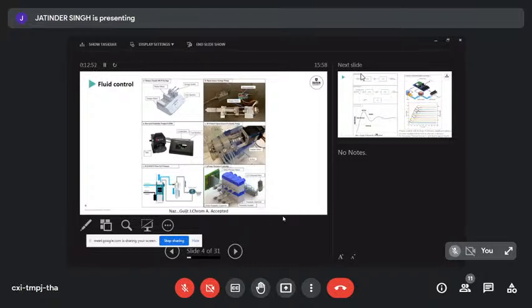We've got our well-known and trusted syringe pump. I've got a lot of good things to say about it, and a lot of bad things as well. There are ones that are commercially available, sometimes even with USB operable programmability. There are also cheaper open source methods. There are even STL files that you can download to 3D print your own manifold that you can combine with a step motor and some rods to get the fluid to pump through the syringe.